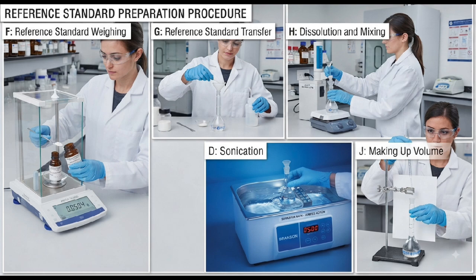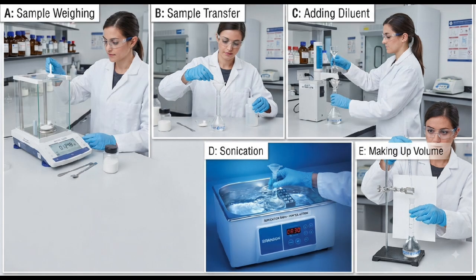Sample preparation. The sample is prepared according to the approved analytical method. Depending on the test, the sample may be accurately weighed, transferred into a volumetric flask, dissolved using the specified diluent, sonicated if required, and diluted to the required concentration.